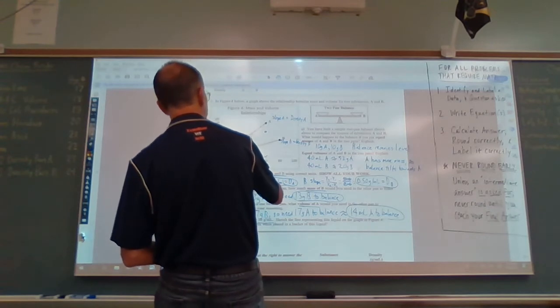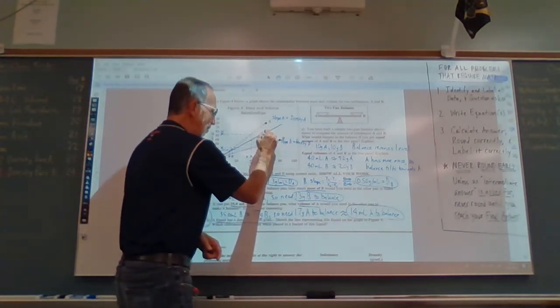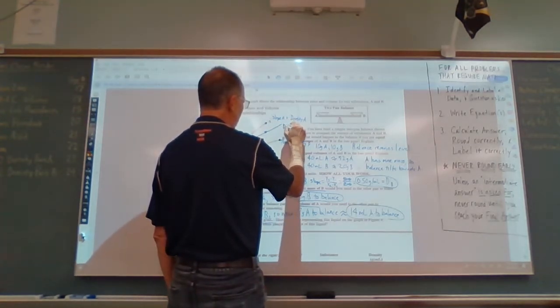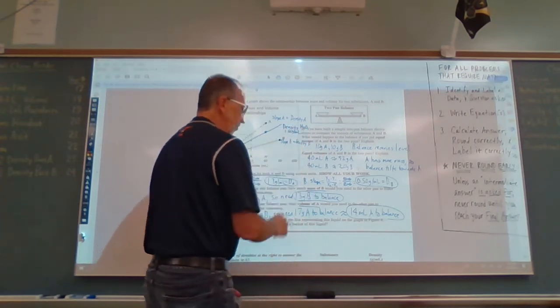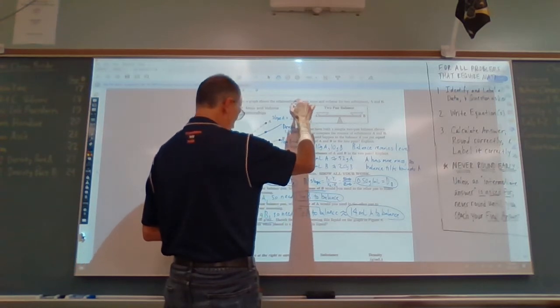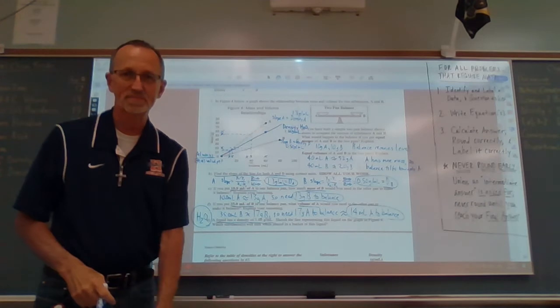Now, I don't have a straight edge with me here, so let's see how badly I can botch this up. Well, that's not too terrible. I'll make my dot bigger. There we go. Now it's fixed. So this then would be the density of water, 1.00 grams per ml. Remember, we established that B was 0.50 grams per ml and that A was 1.3 grams per ml. And as you can see, this water falls in between those.